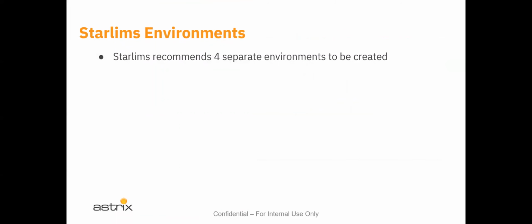So I know that was down in the weeds a little bit. It just merited having to discuss it. You, again, probably won't have to be dealing with that so much, and certainly during the installation, most of the database systems have already been created for you, and you'll be working closely with a DBA.